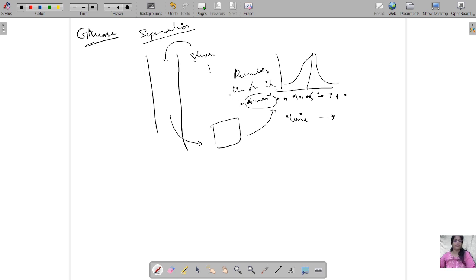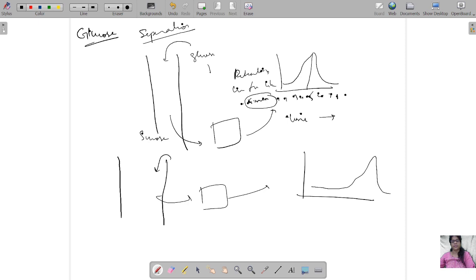In the same way, now go for a new experiment where you have added sucrose. When you add sucrose and detect it in the system, you get a peak at 8 minutes. So this is the retention time of sucrose. Sucrose's retention time is 8 minutes, and glucose's retention time is 5 minutes. So these are the standards.